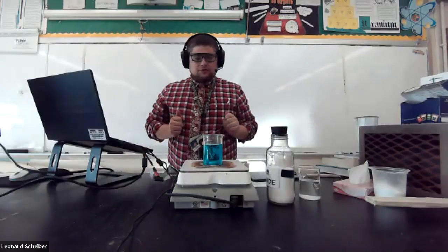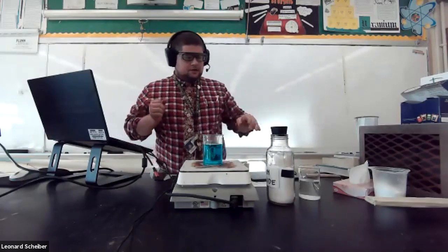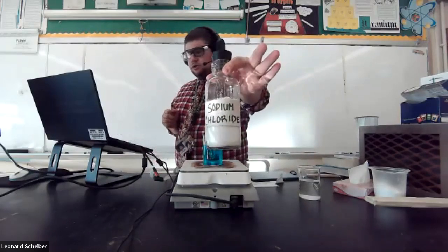Good morning, everyone. I have a cool little demo for you here. We have a copper chloride solution right here. And to it, I'm going to add sodium chloride.